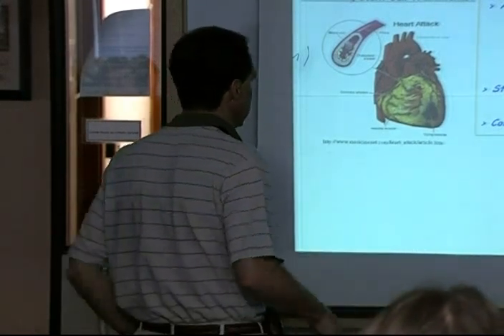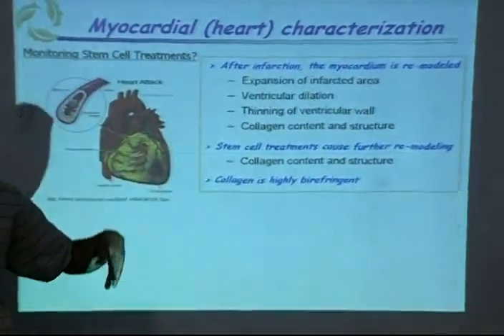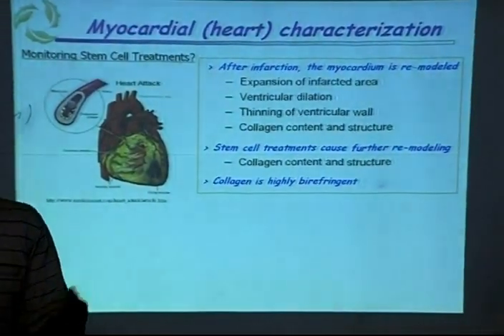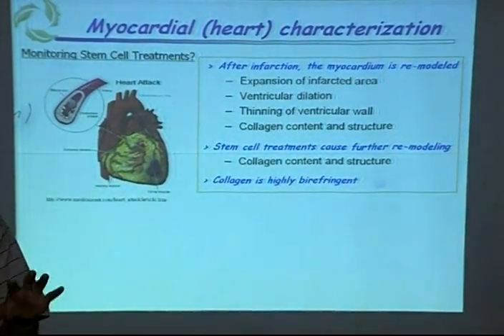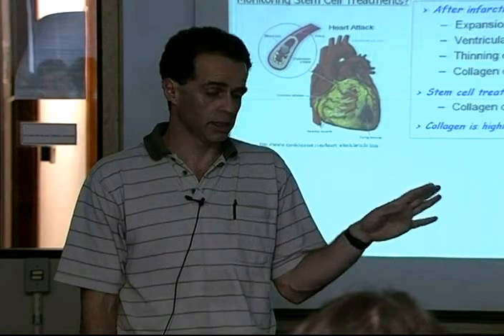So the colleagues are very interested in quantifying collagen birefringence following stem cell therapy, and following injection of stem cells after a person, in this case, has a heart attack.